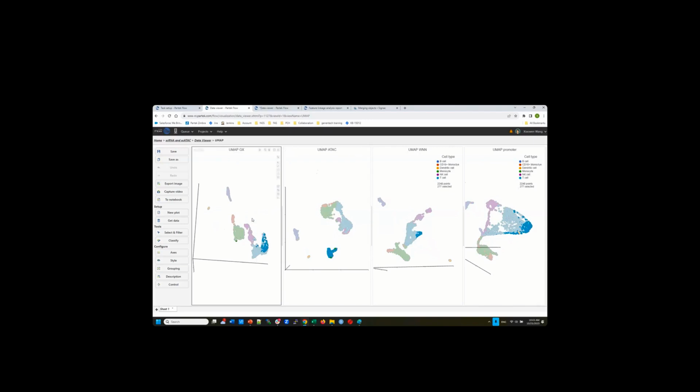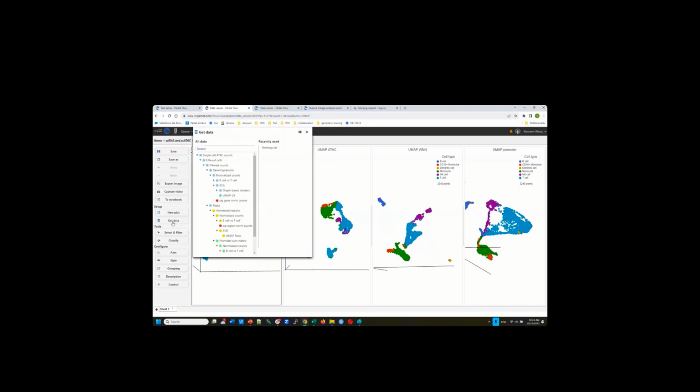I'm not sure what this is. If you don't know what that is, what we can do, with my limited knowledge, since I only know T cells, CD4, CD8, is take a look at those. Suppose I use the gene expression data, because usually biomarkers are genes.